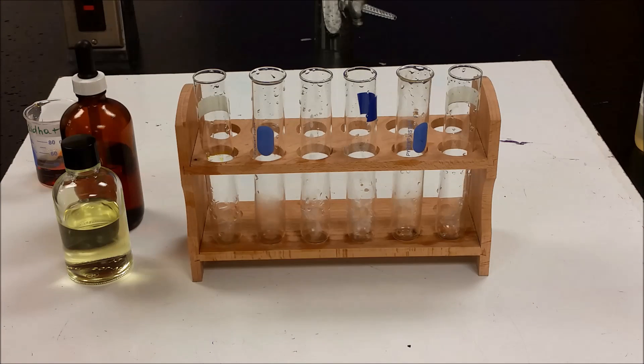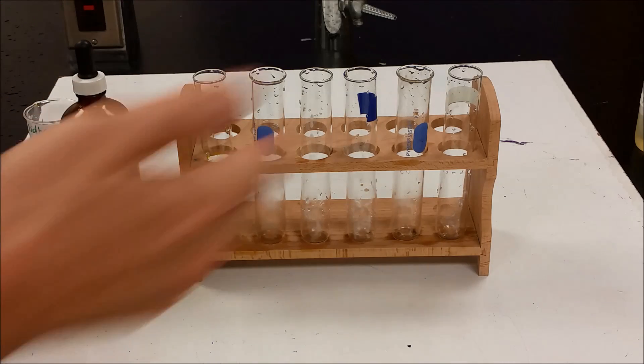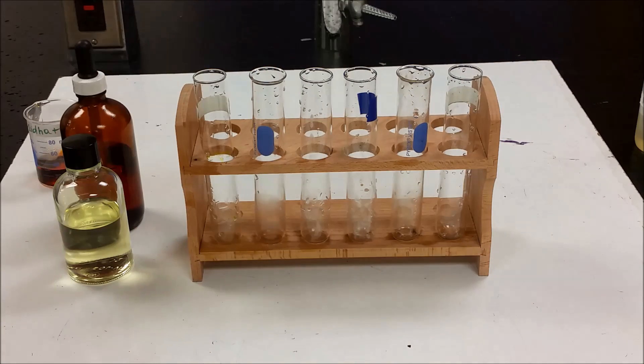We're going to do a little demonstration of the halogen reactivity series. We have some chlorine, some bromine, and some iodine dissolved in water. And then we have sodium chloride, sodium bromide, and sodium iodide. So we're going to take each halogen and react it with the complementary halides.